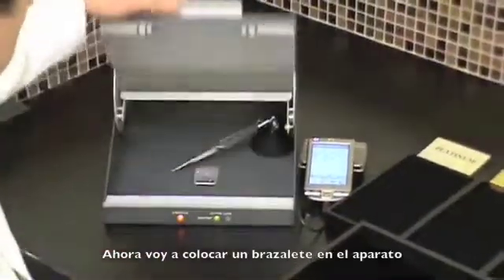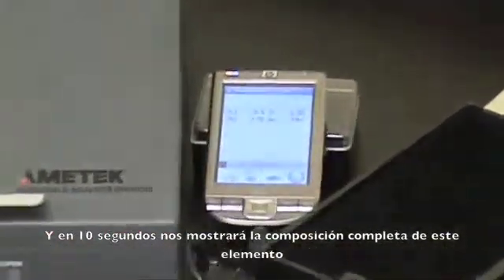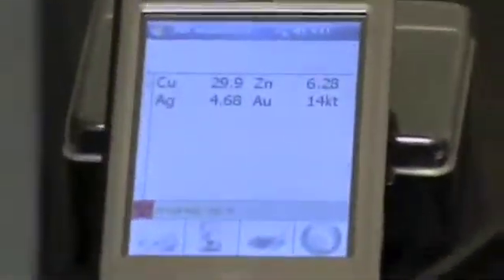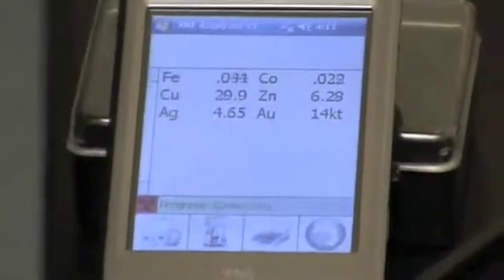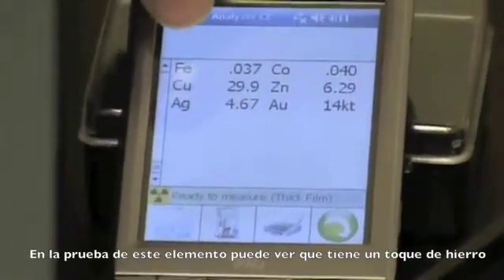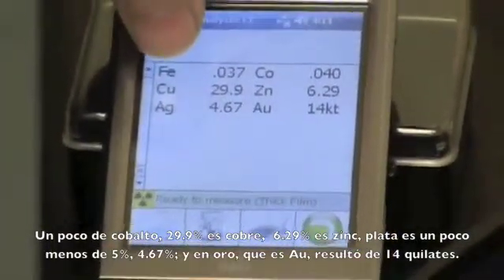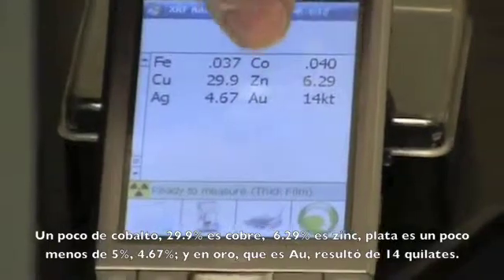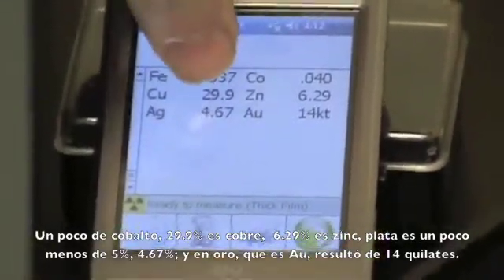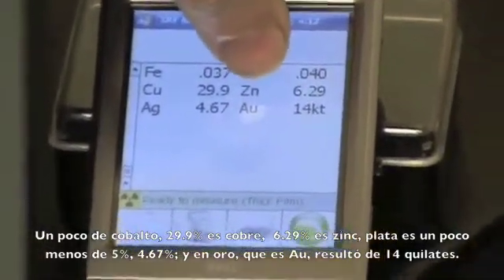So I'm going to place a bangle in here now and within 10 seconds we're going to get the complete breakdown of this item. In testing this item you can see it has just a touch of iron, a little bit of cobalt, 29.9% is copper, 6.29% zinc, silver is just under 5% at 4.67%, and this is testing out at gold which is AU at 14 carat.